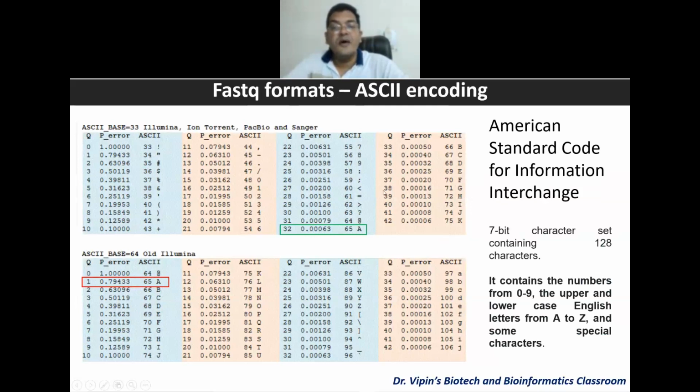But largely, I'm sure you know, we end up around 40. So 40 is a 0.0001 error probability, which is good enough quality, so we don't go beyond that for scoring. Sometimes you will find 41, 42, 43. That is the probability of error at 41, 42. The higher the Q value, the lesser the probability of error, and the more confident you are of your data, right?